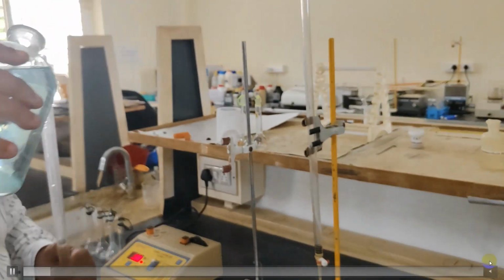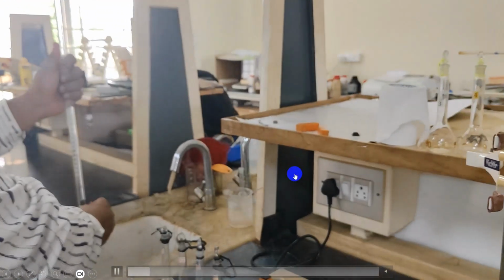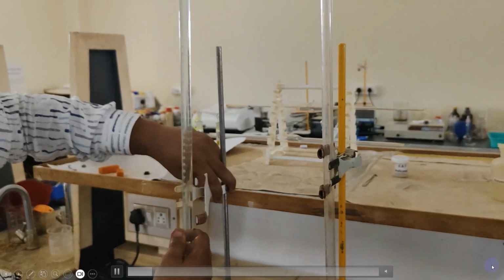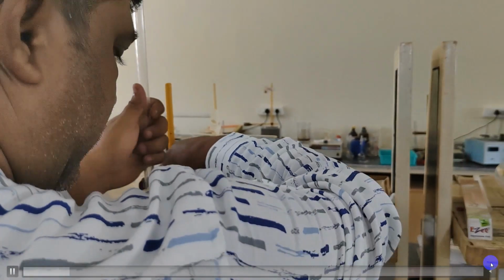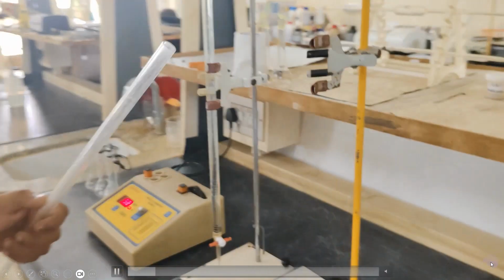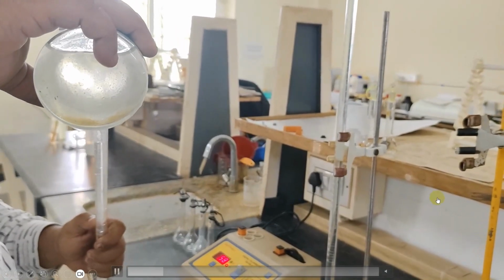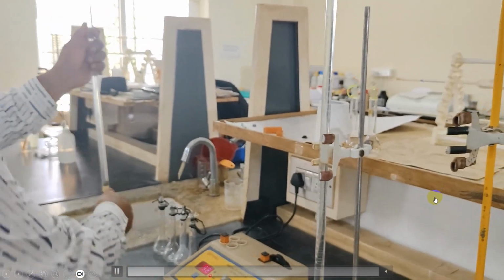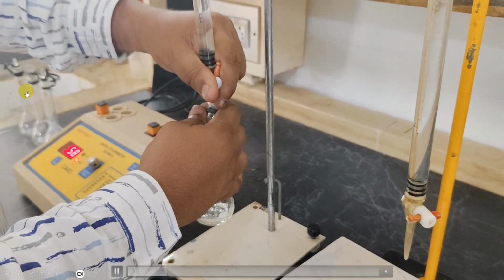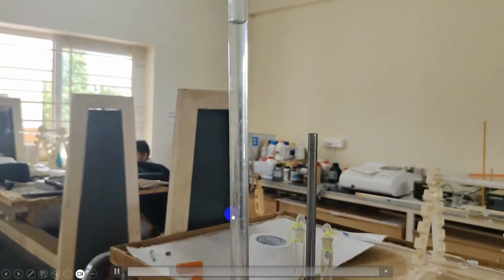Now transfer the copper sulfate solution into the burette and make it to 0. Then to the other burette, fill the ammonium hydroxide that has been prepared. After filling ammonium hydroxide, replace it on the burette stand. Now fill the standard flasks with various volumes of copper sulfate like 5, 10, 15 and 20.